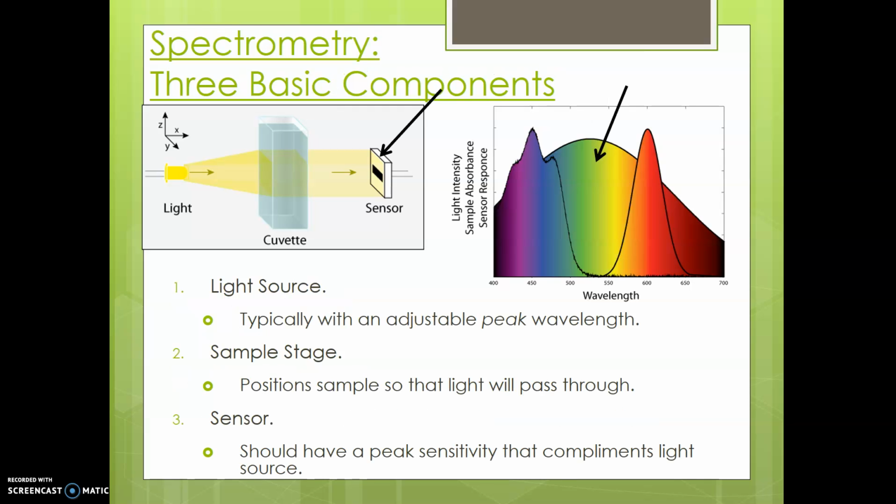It's a little tiny square bottle, and the light is able to go through it. And then you have some sensor that is able to pick up the sensitivity of all of that area, and it's able to sense the differences of that chemical. So if all of a sudden the sensor senses a difference, we can say that it absorbed a certain color of light.